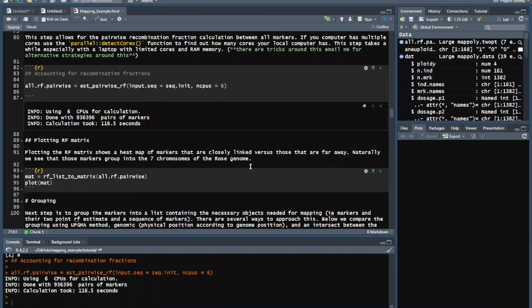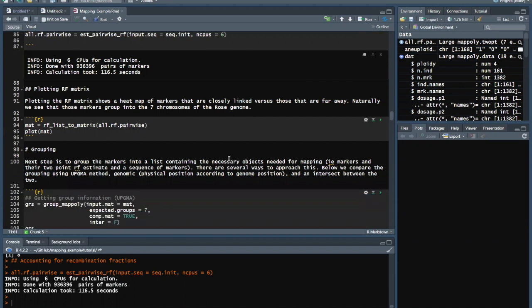Because we cannot give a probability for the parents, it's important that the parents, if you're dealing with sequencing data, be repeated with higher depth or higher quality, because if they are wrong, we'll be all wrong. Exactly. That's why we tend to sequence parents at higher read depth to have more robust genotyping calls, and then just take those positions for the linkage mapping. Okay.